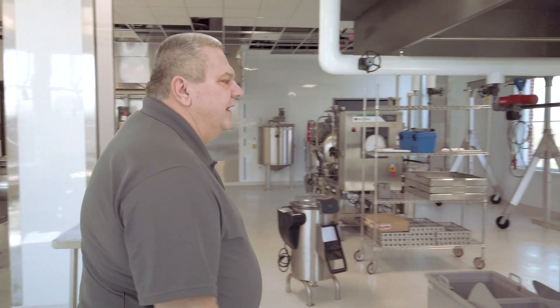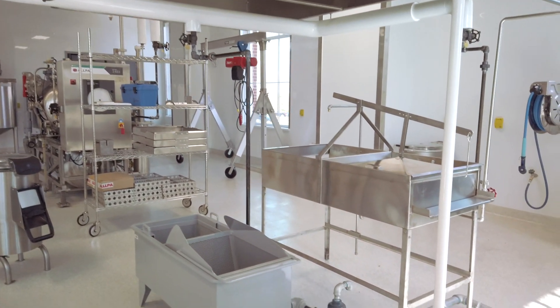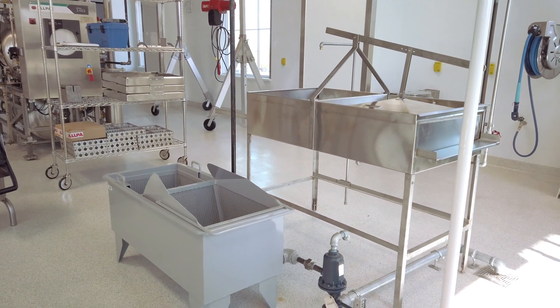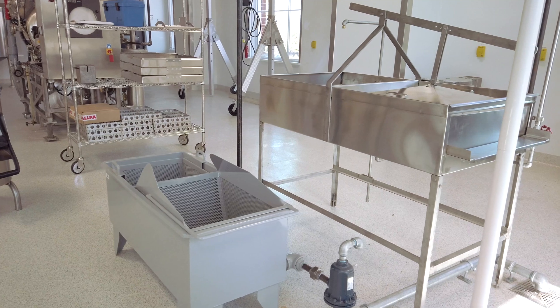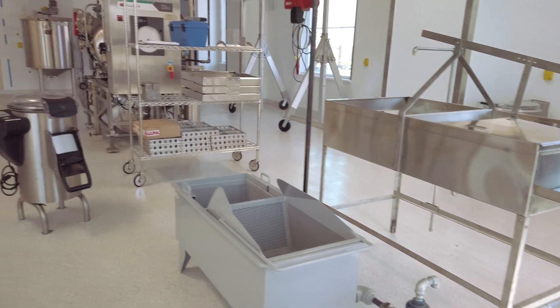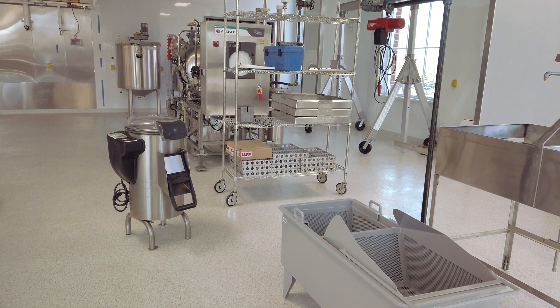We have a blanching tank here. Blanching is a process used to inactivate enzymes which cause deterioration of the fruits and vegetables rapidly. We also then would go from there to peel it. Peeling — we can utilize an ice water bath, or we can use a lye bath, or we have a mechanical peeler for things like carrots and potatoes that are a little bit tougher to get the skin to break.